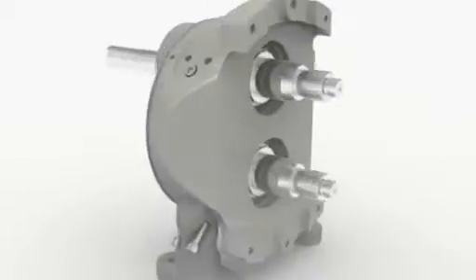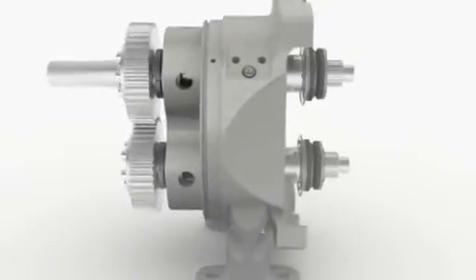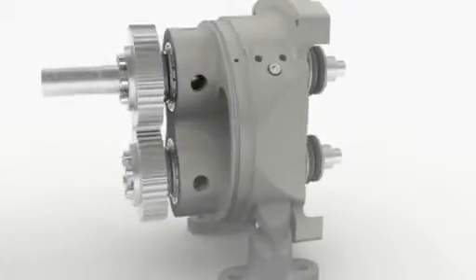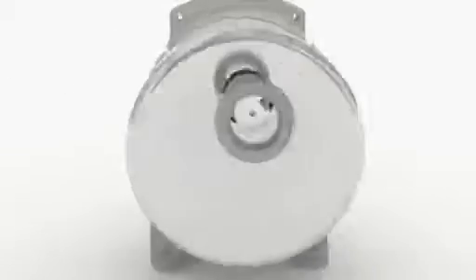Optilobe is a rotary lobe pump for general applications. Available in an optimized range, the Optilobe is designed with simplicity in mind.